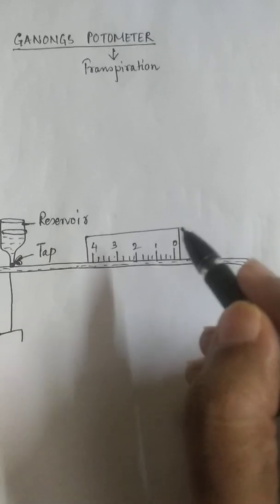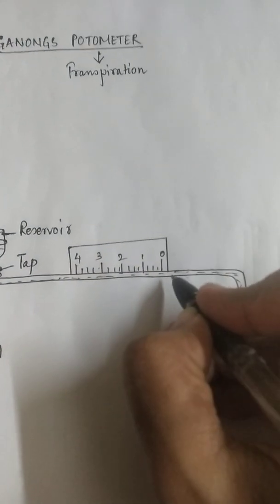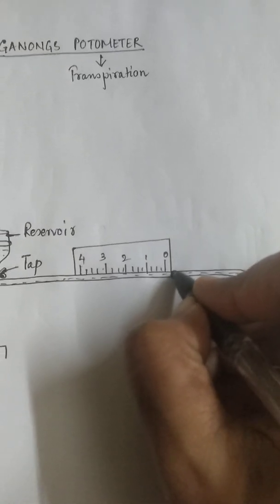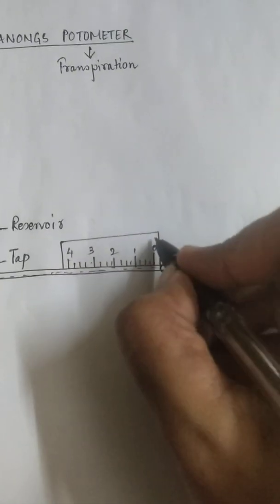Which is not desirable generally. But for this measuring the rate of transpiration I need a bubble. And so I have a bubble over here.